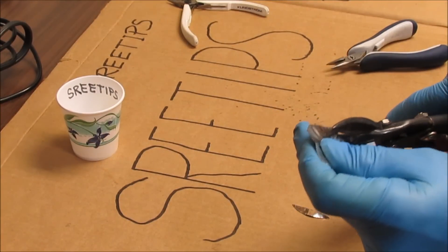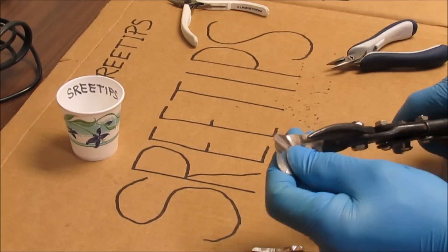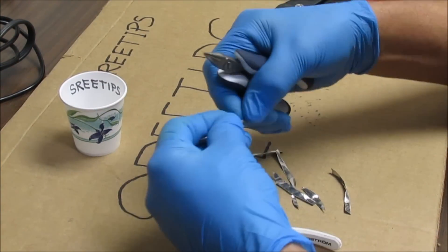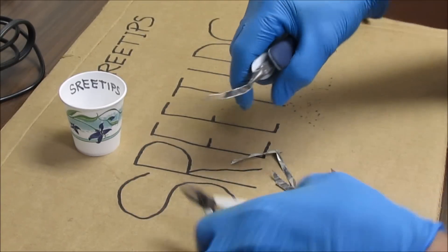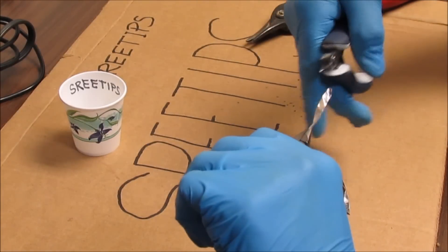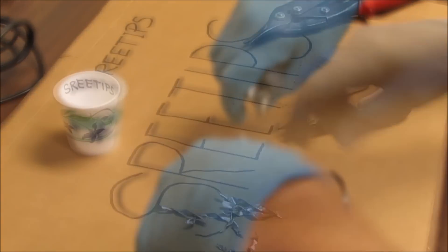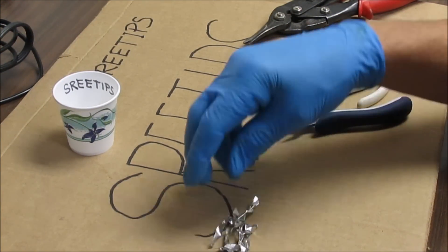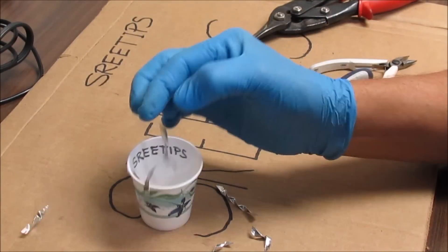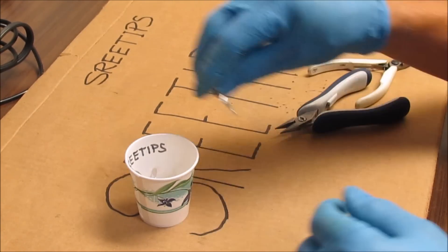I'm going to go ahead and cut this thinned-out platinum coin into thin strips using some metal shears — about a quarter inch wide or so. Now I'll take a couple pairs of pliers and twist these into little coils so that they won't lay flat on the bottom of the reaction vessel when I put the aqua regia in. Next step is to incinerate them to burn off any oils that they might have on them.